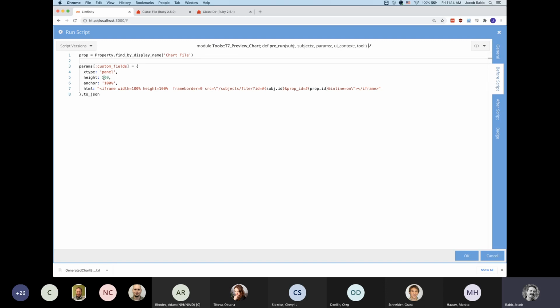You can mess around with the height of the panel a little bit to get it to render differently potentially. One important aspect of this is that it can be used to render PDFs inside the system. So that's very handy. Definitely used in the newest versions of lists, for instance, to render all of the PDFs directly in the system.